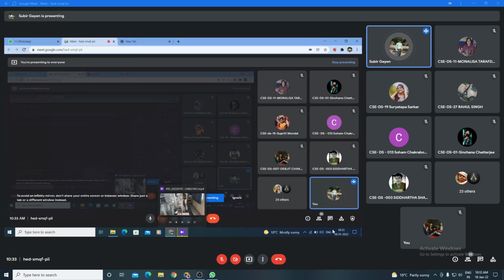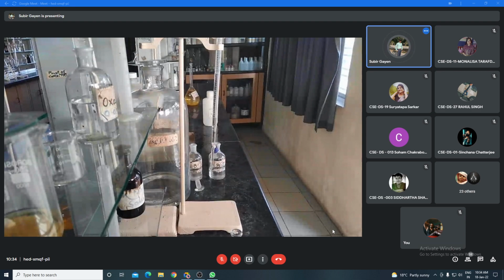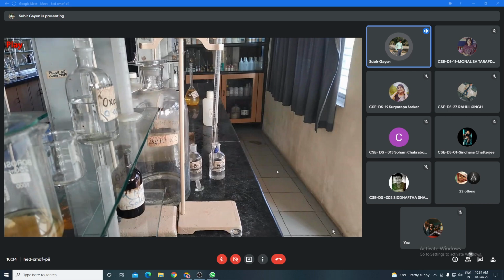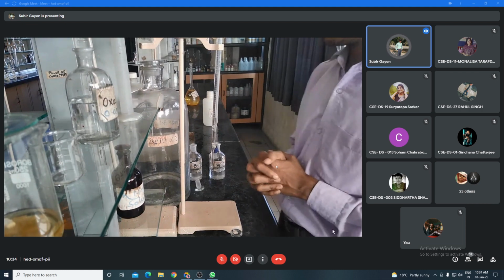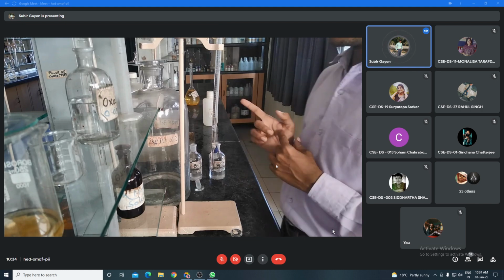Okay, but previously I showed you. Also, it's okay, no problem. You can do it first or at last, no problem. So at first, I have to do the standardization process because sodium hydroxide is a secondary standard solution.